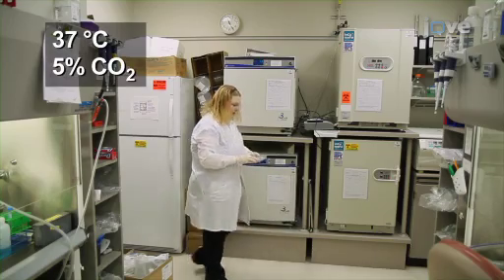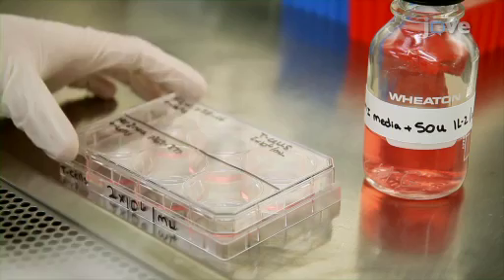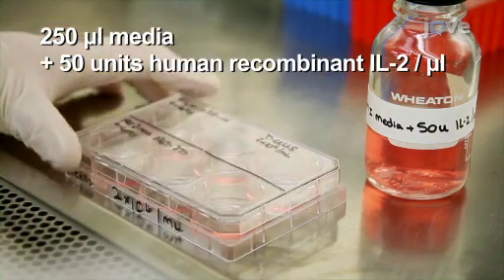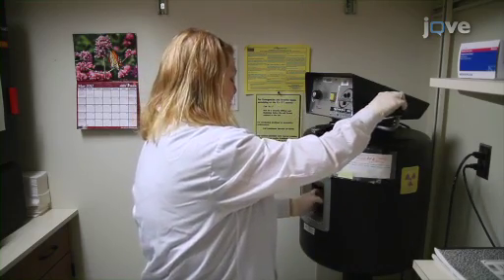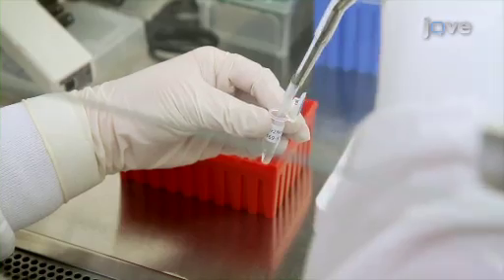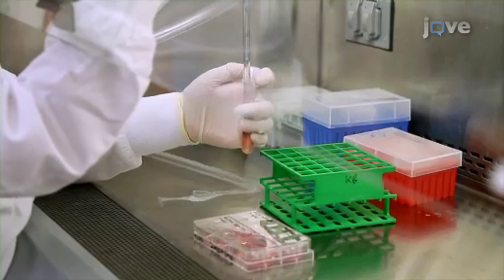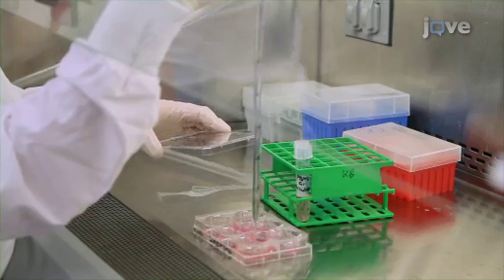Culture the cells. On alternate days, to help stimulate and expand T-cells, add fresh media supplemented with human recombinant IL-2 for a final concentration of 50 units per milliliter. After one week, prepare a culture of autologous PBMCs. Irradiate the cells and pulse them for two hours with the same HLA-A2 binding peptide at 10 micrograms per milliliter. Restimulate the culture by adding one milliliter of the irradiated autologous PBMCs to each well.